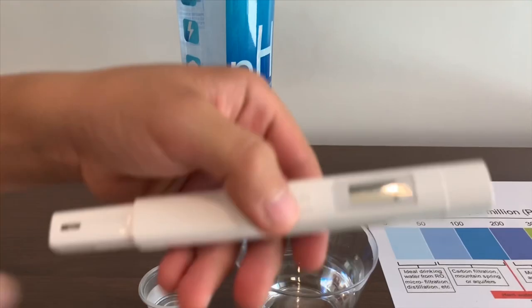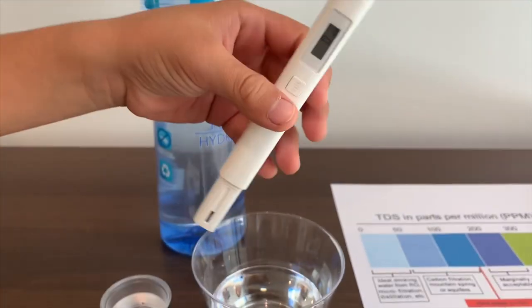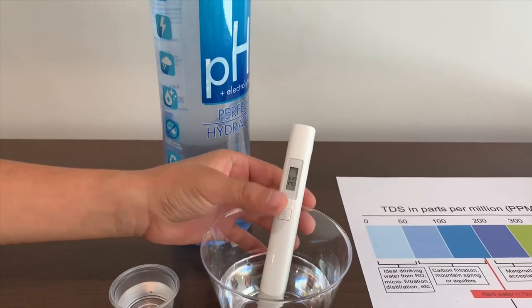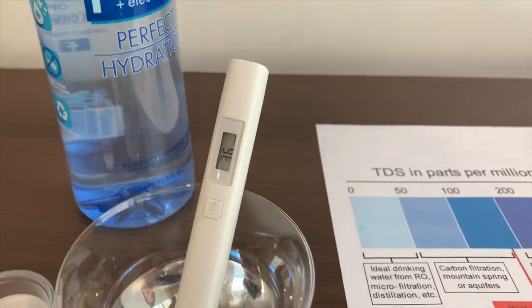Let's turn on the TDS tester, make sure it's on zero, and let's put it in. Let's see what number it's on — it's on 36.